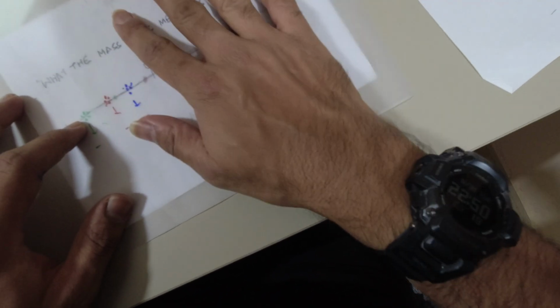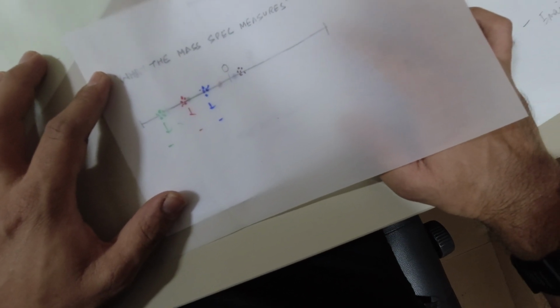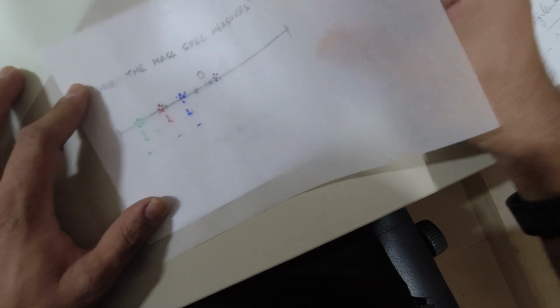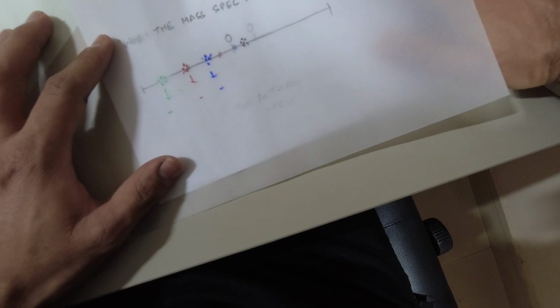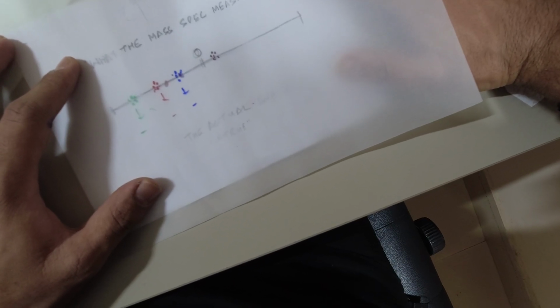And now when I run the software, I can see that it's offset a little bit. So what I'm essentially doing when I'm changing the values of the so-called house gas on Isodat software, if my understanding is correct, is just sliding the scale at the bottom to match what I'm getting.